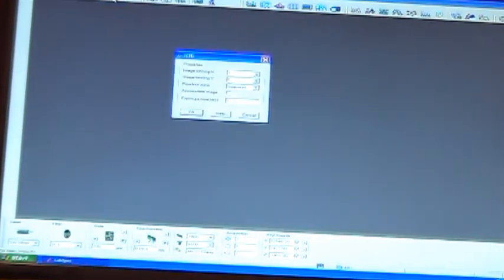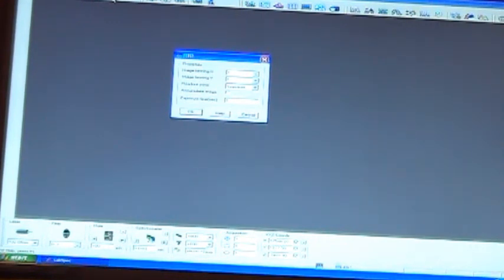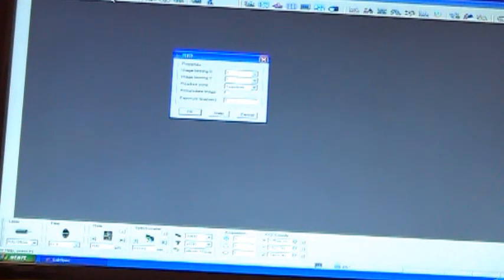Next one down under the acquisition tab is going to be RTD, for real-time display. In this window here, this affects your RTD display. If you notice in the top of the window, it says image binning, X and Y. If you're acquiring a very big map, or you're trying to image on the face of the CCD to see kind of like an old school Raman spectrum, you can actually combine pixels together to form fewer data points so you can get your data faster.